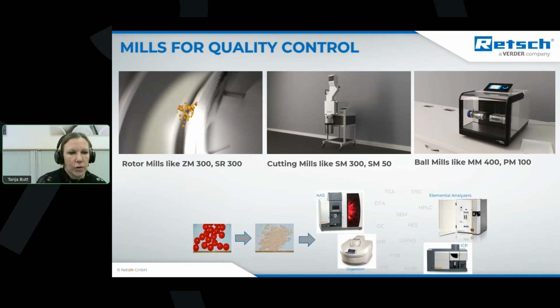Then the pre-crushed sample comes between the ring sieve and the rotor, and it is further crushed by friction, and you then get the very fine particles in the collecting receptacle as soon as they fit through the apertures of the sieves. By changing the sieve aperture sizes, you can influence how large the sample is in the end. Larger aperture size, larger particles; finer aperture size, finer particles.